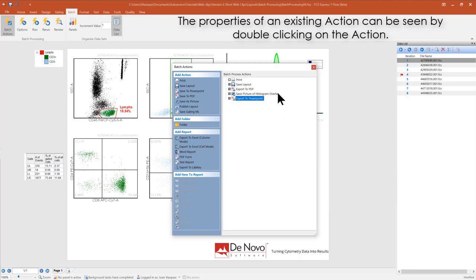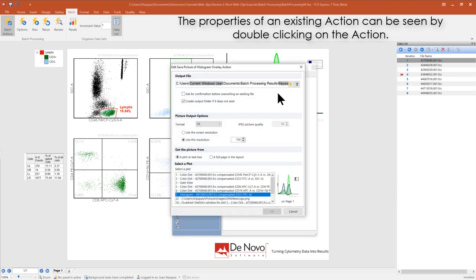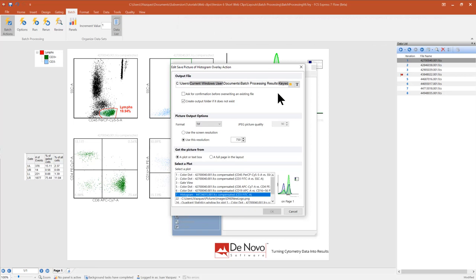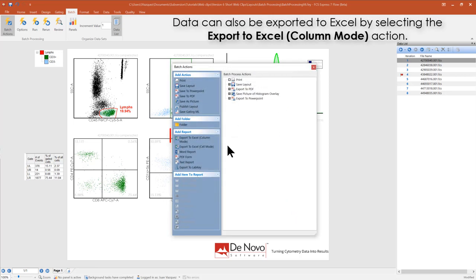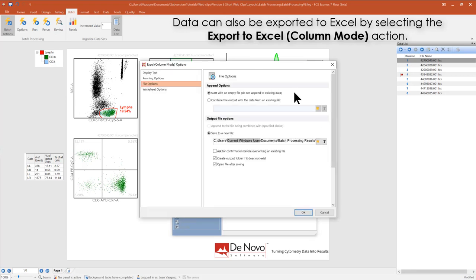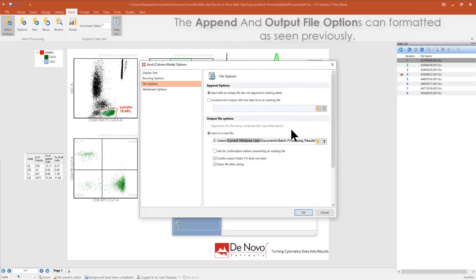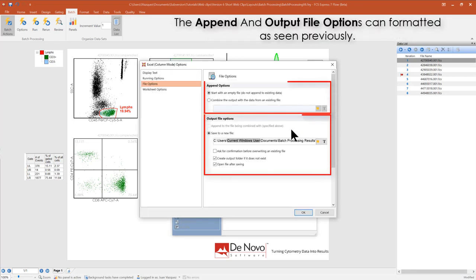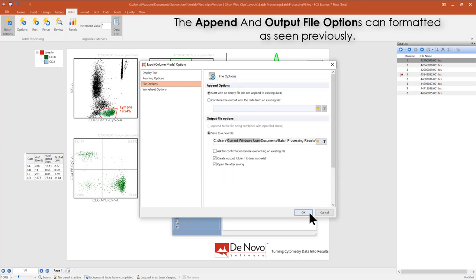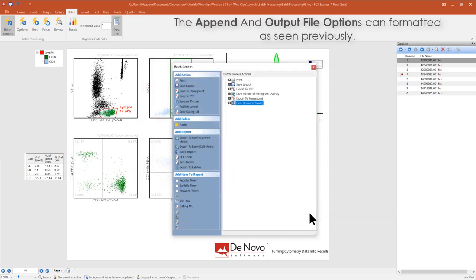The properties of an existing action can be seen by double-clicking on the action. It can also be exported to Excel by selecting the Export to Excel column mode action. The append and output file options can be formatted as seen previously.